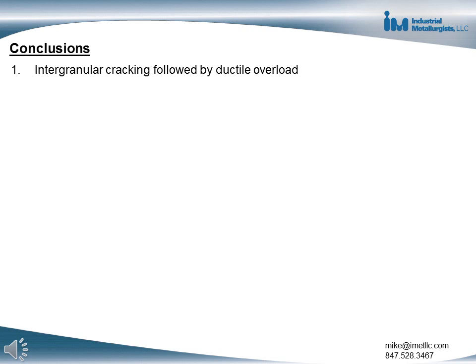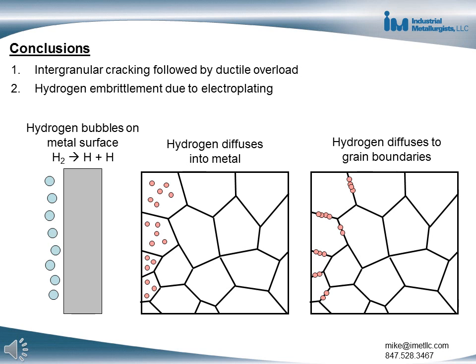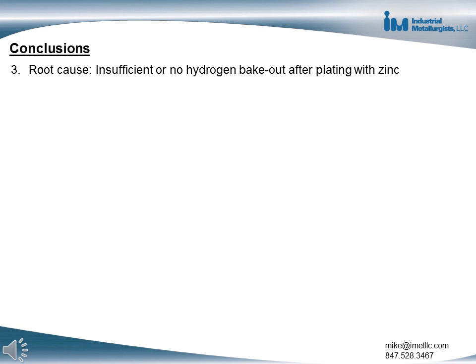Based on the data presented, the conclusions are that the screw failed due to intergranular cracking followed by ductile overload. The intergranular cracking was enabled by hydrogen embrittlement that occurred when the steel screw was electroplated with zinc. During electroplating, hydrogen bubbles form at the metal surface. The hydrogen can diffuse into the metal and onto the grain boundaries, weakening them.